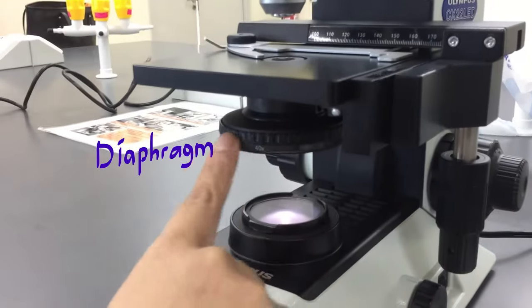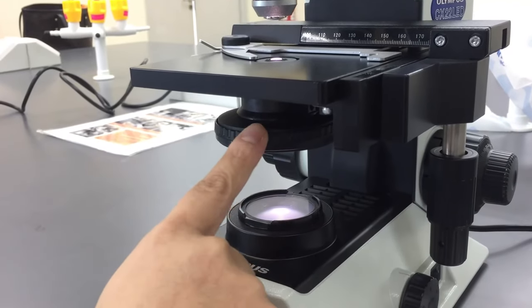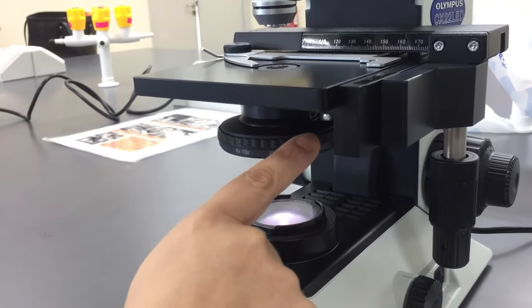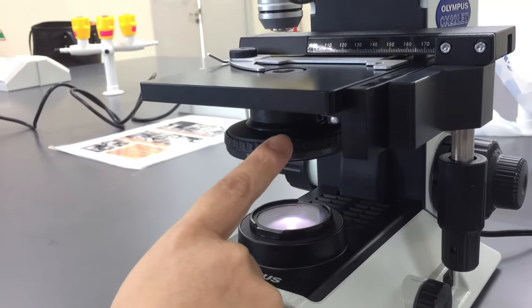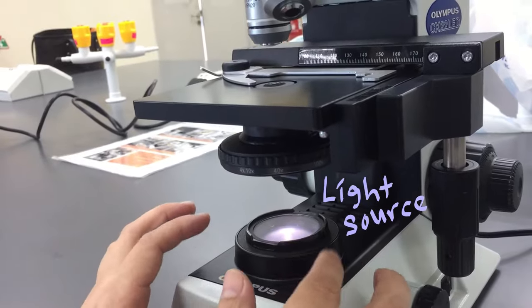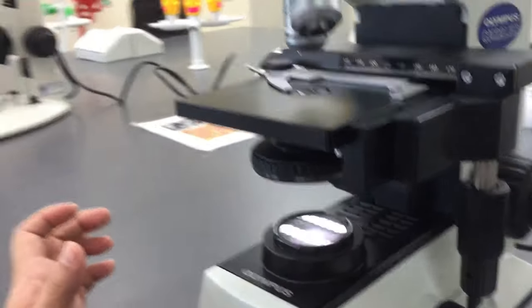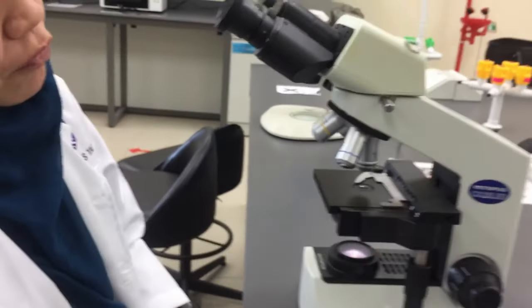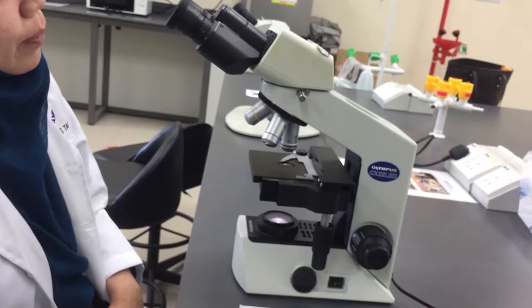This is the diaphragm of the microscope. The diaphragm functions to control the amount of light that goes to your specimen. And this is where the light source comes up to the specimen. That's all for the introduction of light compound microscope parts.